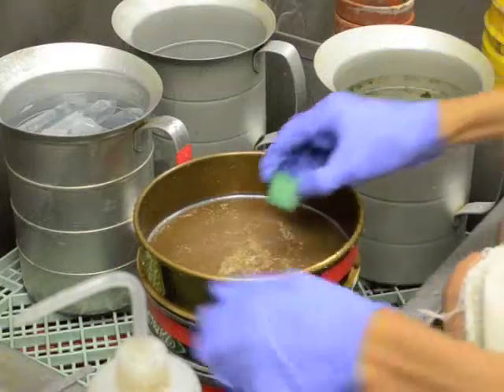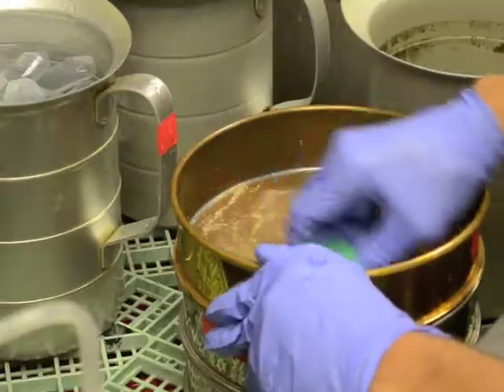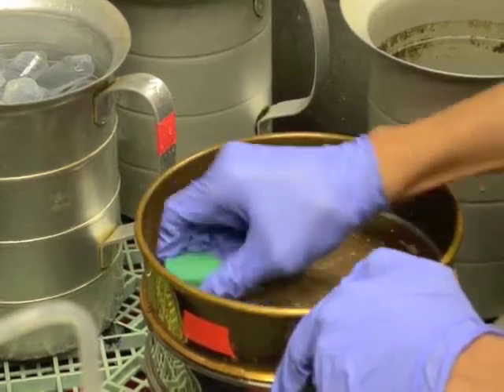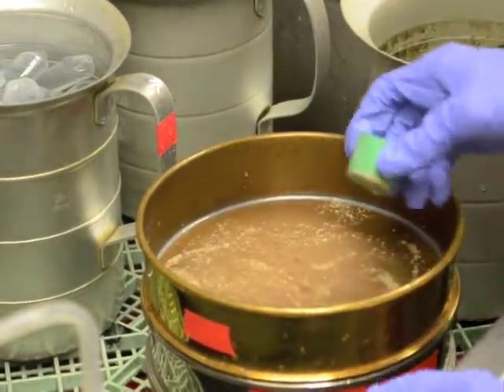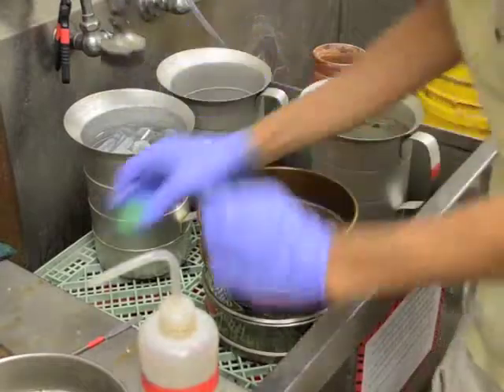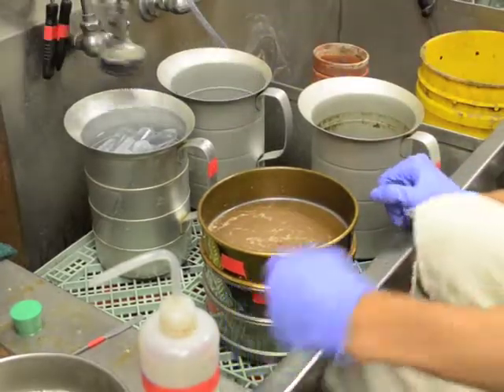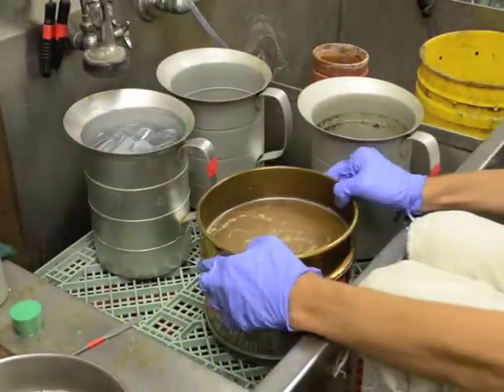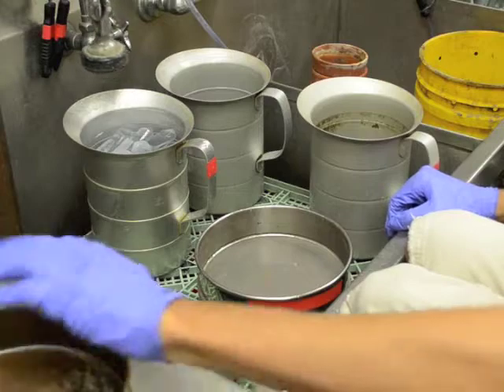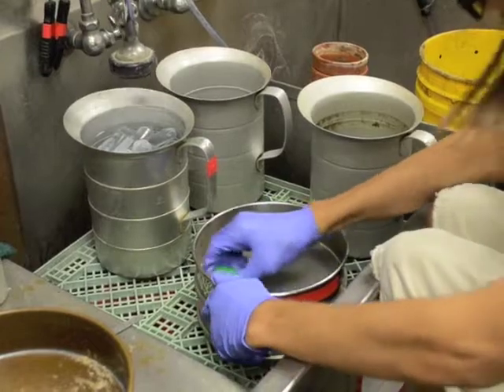Using a rubber stopper, crush the cysts into the sieve to release the eggs. Rinse the sieve and remove the top sieve. Use the rubber stopper again to crush any remaining cysts that may have made it through the top sieve.